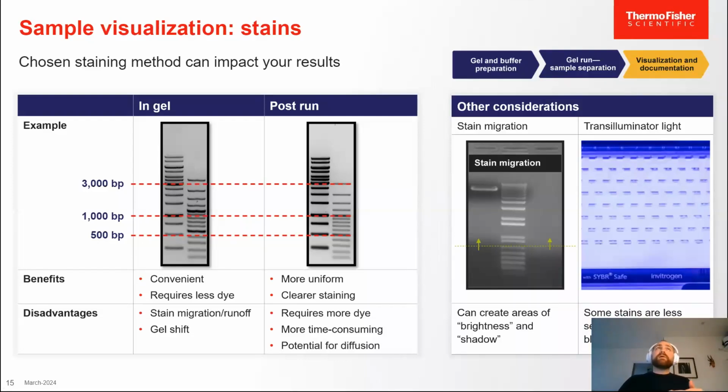It experiences stronger resistance while migrating through the agarose matrix. So as you can see here, while these are two exactly the same segments, exactly the same sizes, you can tell that, say, this fragment here is slightly higher than this fragment, representing a different type of size. You might be interpreting your experiment wrong if you're extremely sensitive to what the sizes of your fragments tested are. Additionally, you can also tell that these are not very nice.